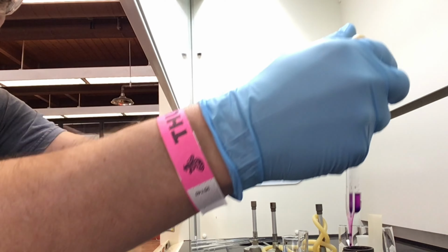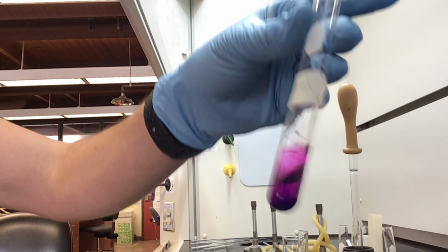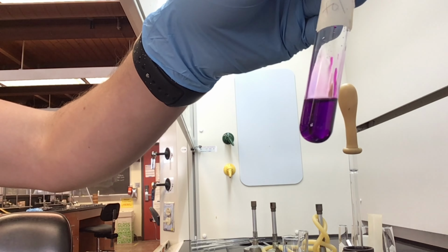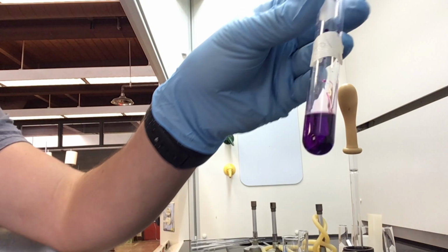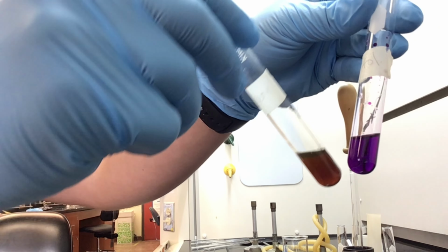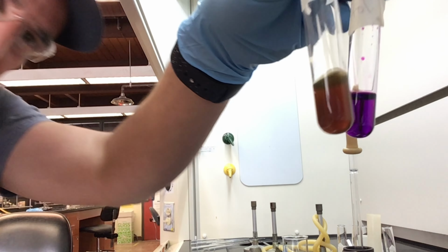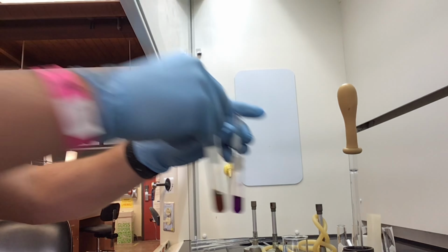That's it. Pretty much. Remember, you don't want to let this sit for too long before you observe any changes and record those and use that data, because this is an ethanolic solution. But comparing again, you can see, yeah, gross.